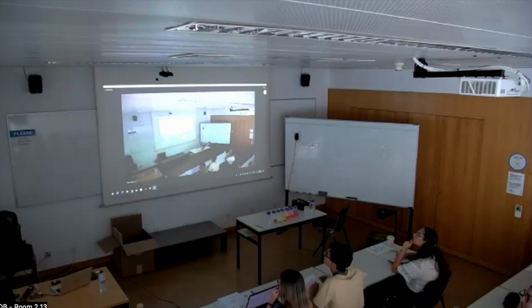Now I change wire, and I'm using a different dimension. Okay, you see the spot. I'll put the wire in front. Do you see the diffraction pattern? How does it look? So tell me, what's the difference between this and this? It's really important because these are all considerations. Do you see this? So how is this diffraction pattern with respect to the previous one?